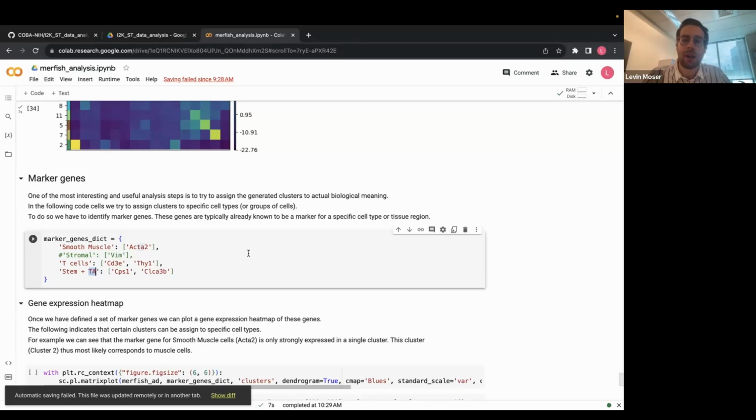And what we can do now, and this again, to follow up on an earlier question, is completely dependent on the experiment and on the tissue that you're working with. And this is where biology then meets bioinformatics, right? This is a biological input into our data analysis platform.